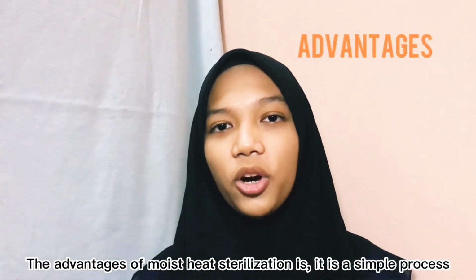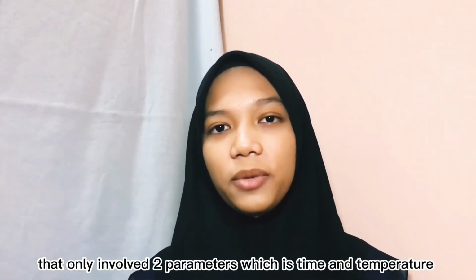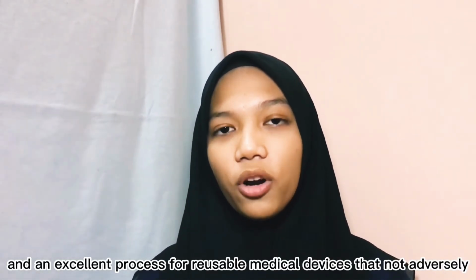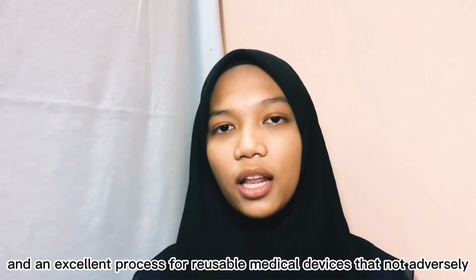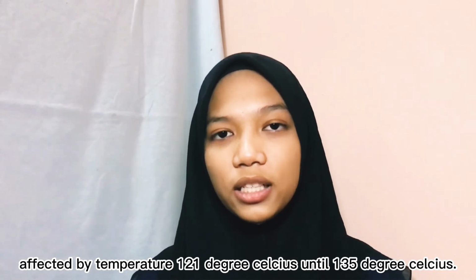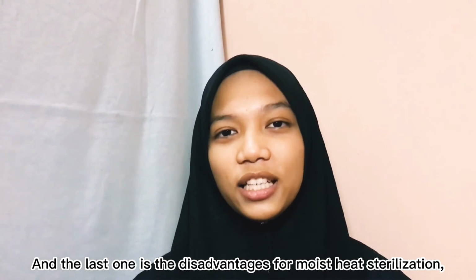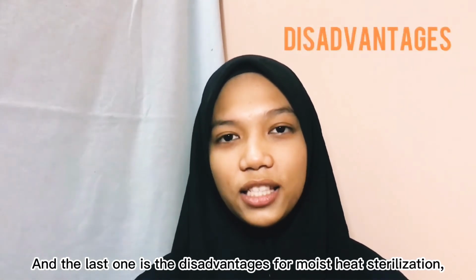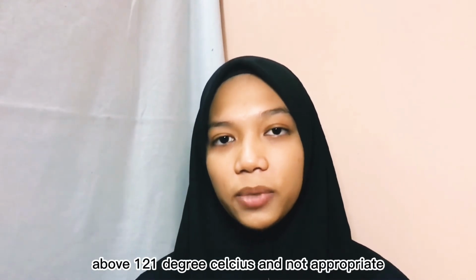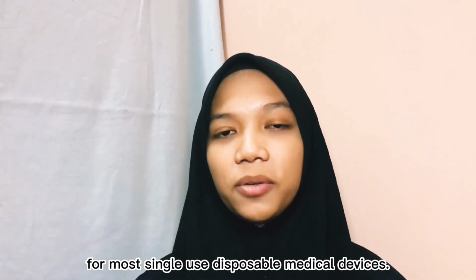The advantage of moist heat sterilization is that it is a simple process that only involves two parameters, which are time and temperature, and it is an excellent process for reusable medical devices that are not adversely affected by temperatures of 121 degrees Celsius to 135 degrees Celsius. And the last one is the disadvantages of moist heat sterilization. Many products and packaging materials cannot tolerate high temperatures above 121 degrees Celsius, and it is not appropriate for single-use disposable medical devices.